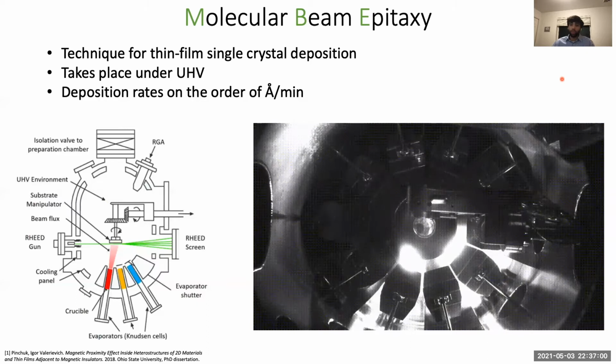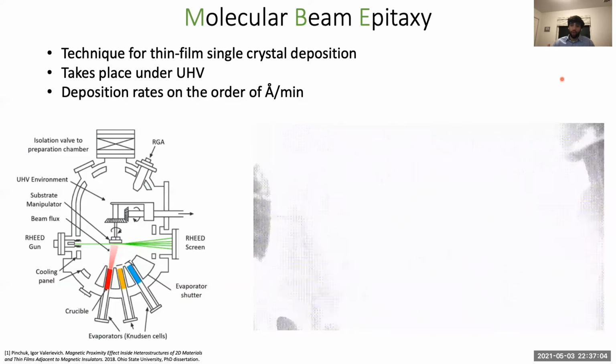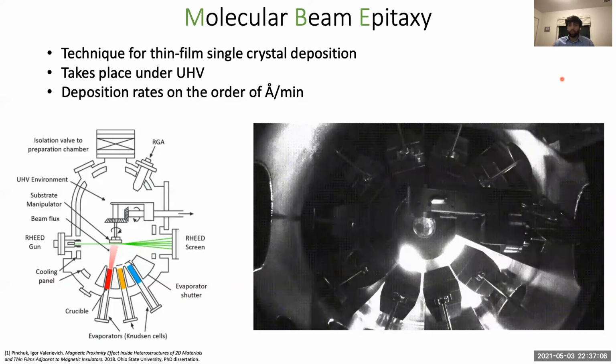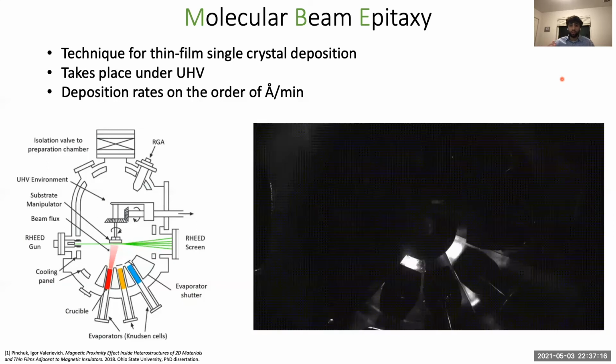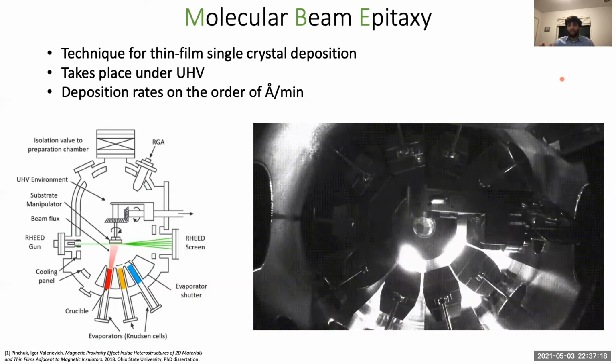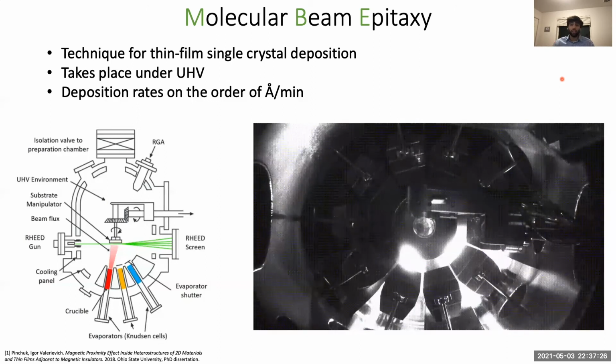We're able to monitor this deposition rate with something called a deposition monitor that contains a special quartz crystal. As material is deposited onto the sensor, the natural frequency at which the crystal resonates changes as a function of mass deposited. And since this behavior is well defined, the deposition monitor is able to provide deposition rates on the order of fractions of angstroms from just very small mass changes.